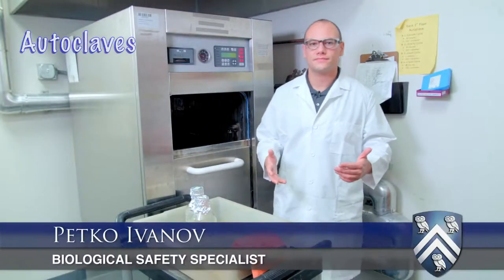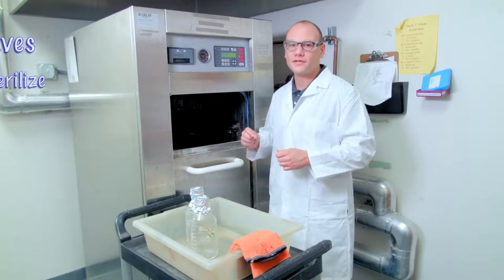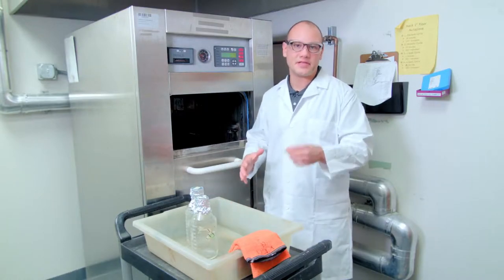Let's talk about autoclaves. Autoclaves are common pieces of laboratory equipment used to sterilize materials. Most often they're used to prepare laboratory reagents as well as decontaminate waste before disposal.